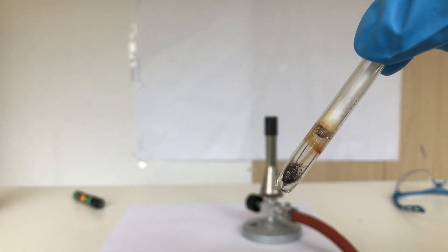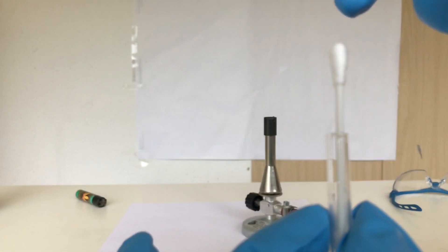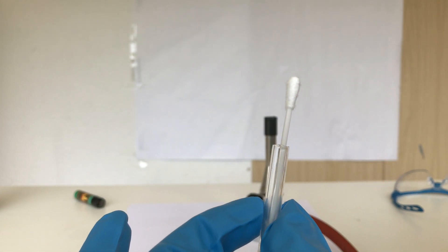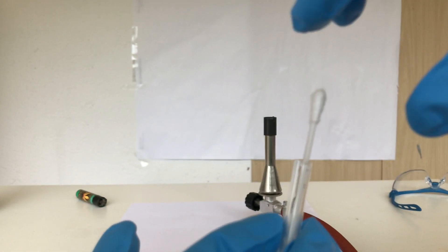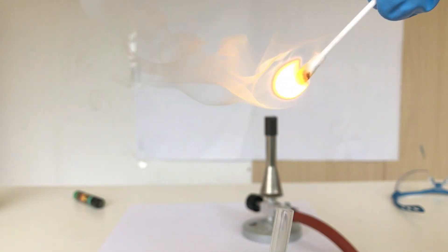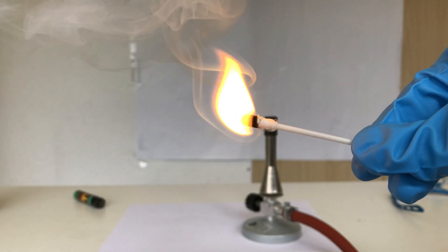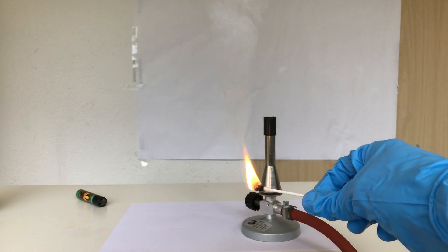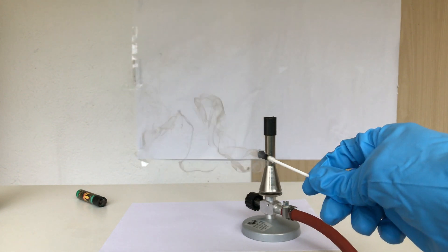For the demonstration I am now going to pull out the q-tip — keep in mind I let the test tube cool down to room temperature before doing this. You can see the q-tip immediately lit up and produced a lot of white smoke. Do not breathe this in.